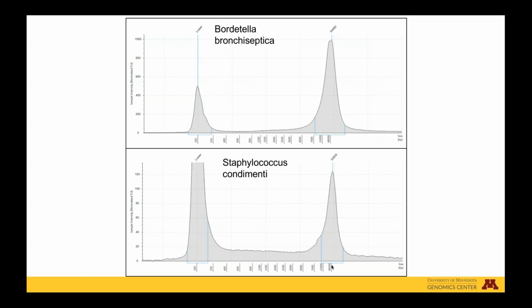But we do need it to be above about 40 kb, not because we expect to construct libraries of this size, but because we need to be able to get a consistent shear. Starting from DNA that's already fragmented results in over-sheared libraries. So these electropherogram plots from the TapeStation genomic assay show that the resulting DNA looks to be primarily above 40 kb, although due to compression, that's not always super reliable.